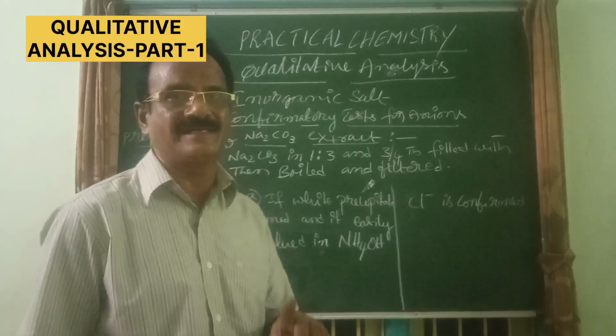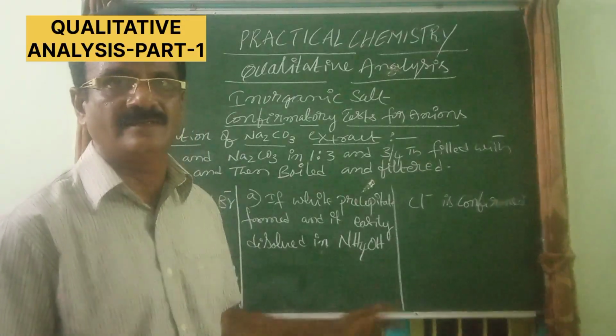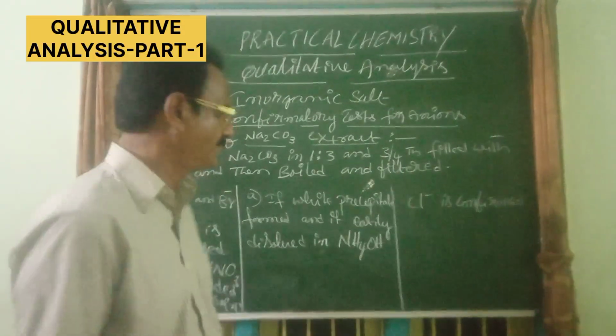This is the confirmatory test for Cl minus. Okay, the observation is like this.